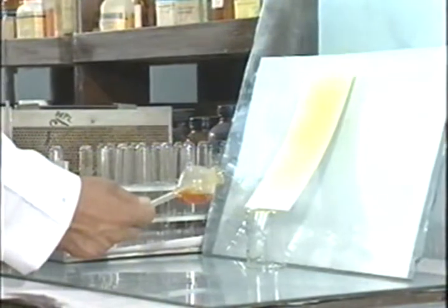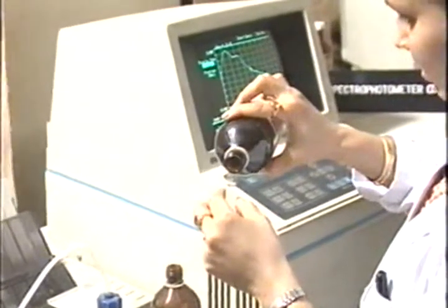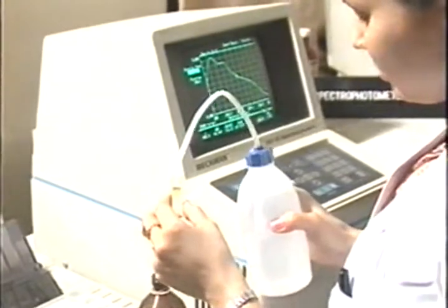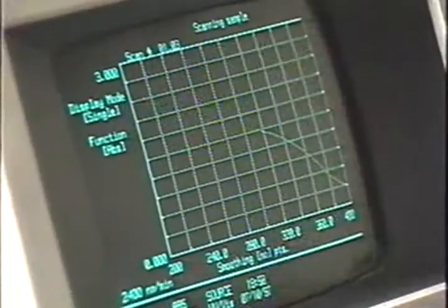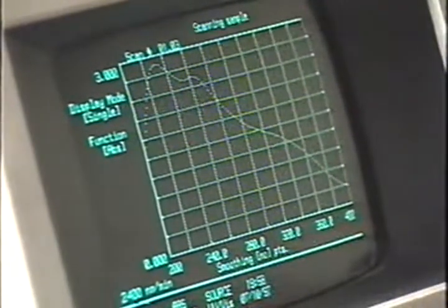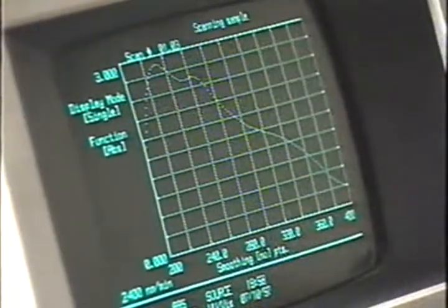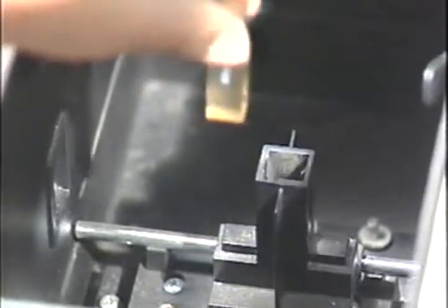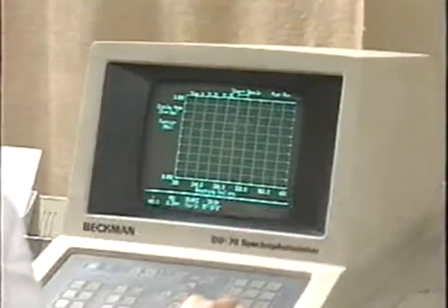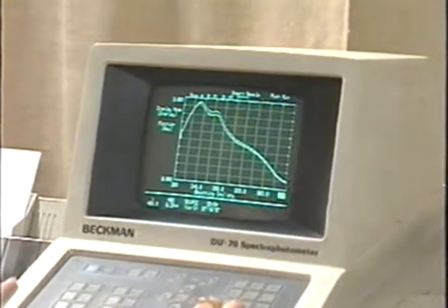specific reagents. UV spectrophotometer is used for estimation of active ingredients of drugs like alkaloids, glycosides, steroids and functional groups of compounds present in the drug. It gives characteristic absorption patterns and absorption maxima under UV light from wavelength 400 to 200 nm and for colored compounds from 400 to 800 nm. Using UV spectrophotometer, the drug can be characterized even with a few drops of sample, and the spectra so obtained is superimposed with the standard spectra stored in the computer.